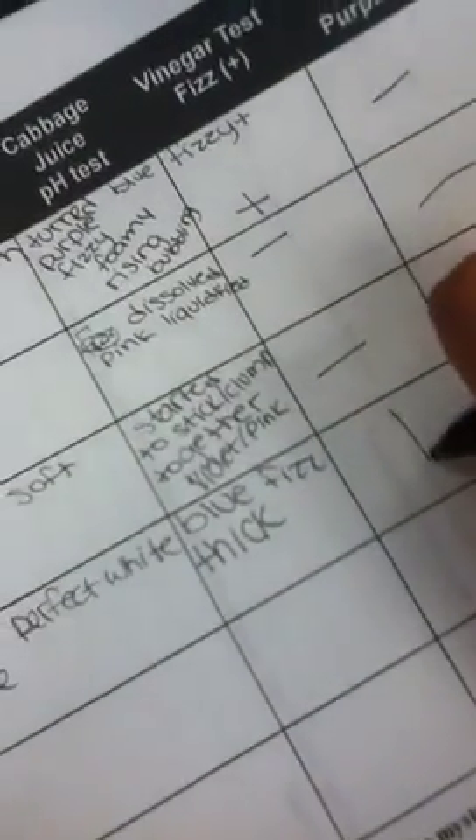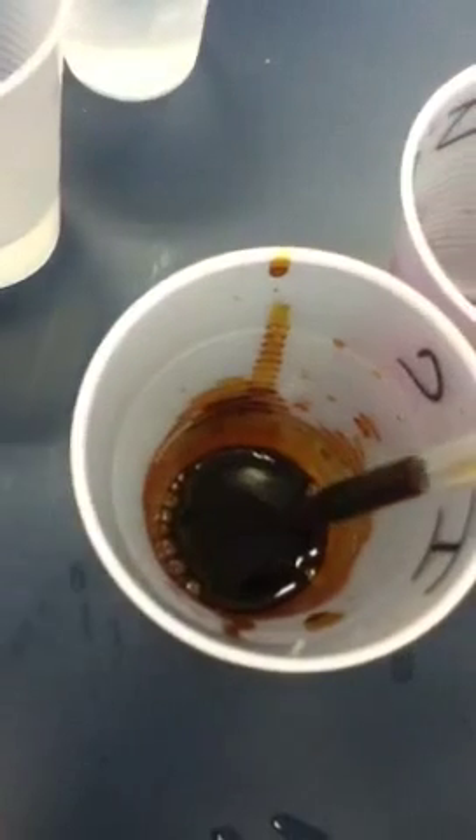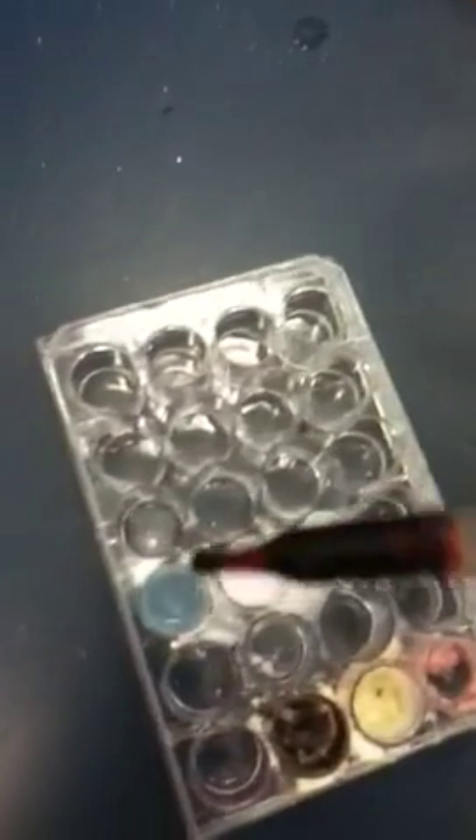Alright guys, it's working. I don't know. So let's write this. Plus. Next we have iodine. Okay. Yes, I did actually.